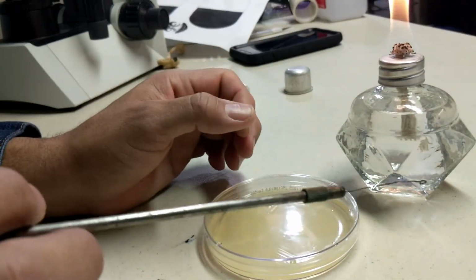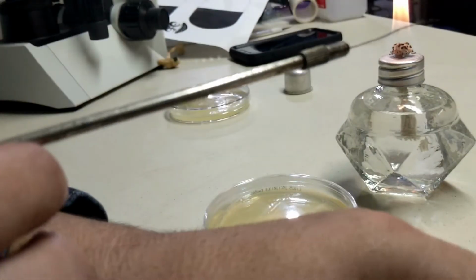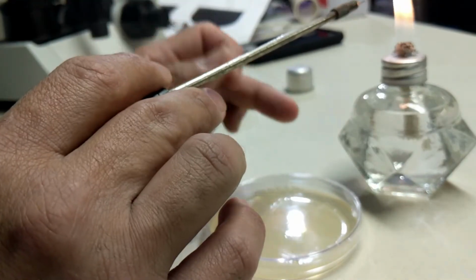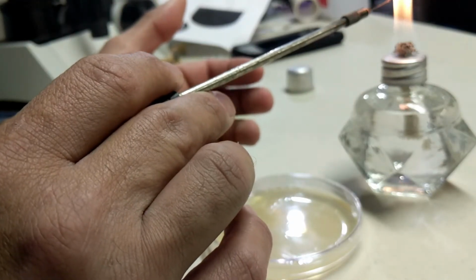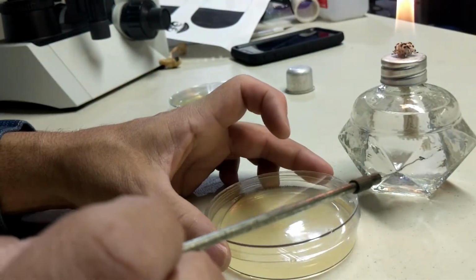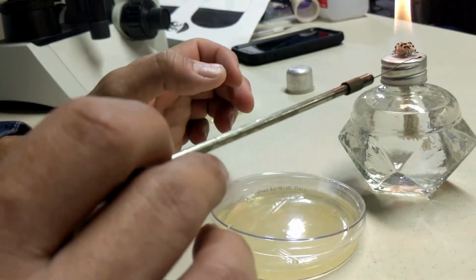And another thing that I want you to hear, let me see if you can actually hear is this. When it's red hot, there's no bacteria in here. One technique that some people use, sometimes I use it, if you really want to hurry up, is that you pretty much touch the agar. Hopefully you hear it.